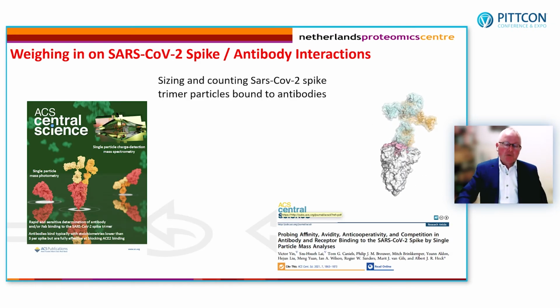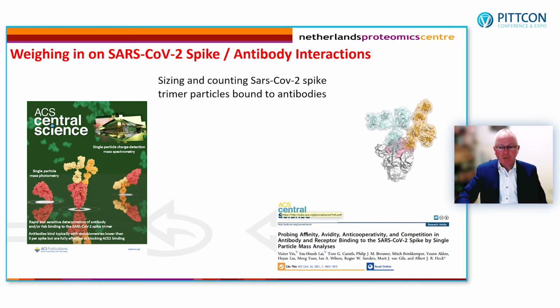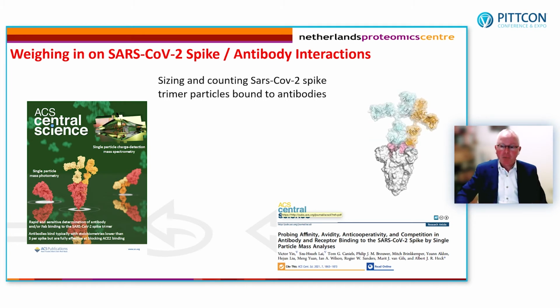So the particles that we measure, you see roughly on the right, and you might now say, why are there not 3 antibodies bound to the trimer? Maybe this picture tells more than what I can say. You see that the size of the antibody, here in blue and orange, is about the size of the full trimer spike protein as well. And you can easily think how maybe 3 antibodies would sterically clash with each other if they want to bind to such a spike trimer.